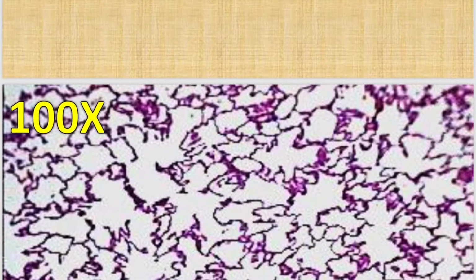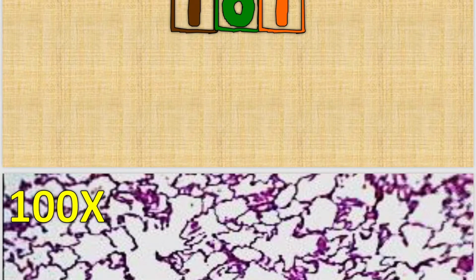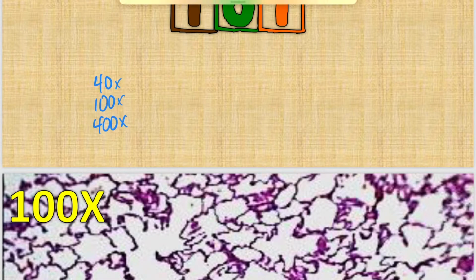That is the magnification. So there are 3 objective lenses when we're zooming in on things. You're going to see things that say 40, 100, and 400. So obviously, if something is zoomed 40 times bigger than the human eye, it's not zoomed in nearly as much as if it's zoomed 400 times than the naked eye can observe. So that's super important as you're going about doing this because this picture that you're seeing, or this slide right here, which you would see under a microscope, is exactly the same thing as this slide. It's just zoomed in 4 times as much.